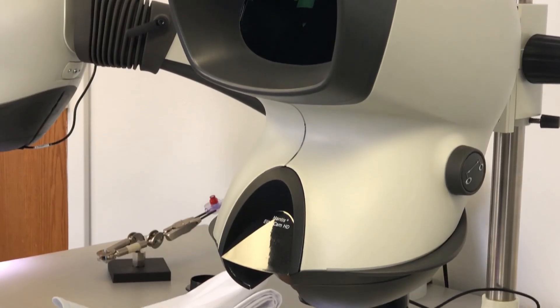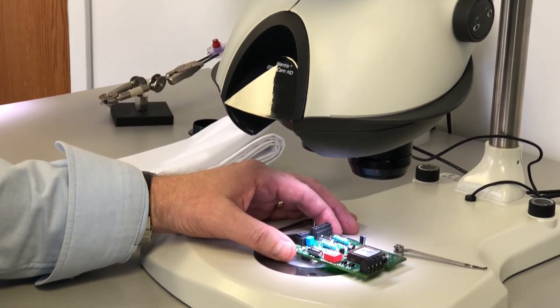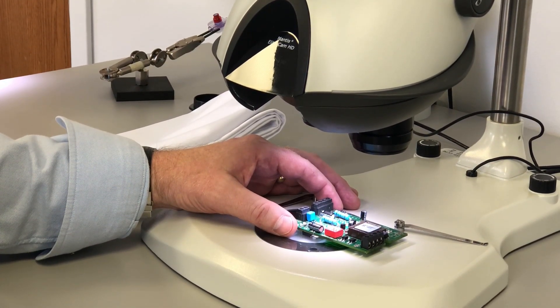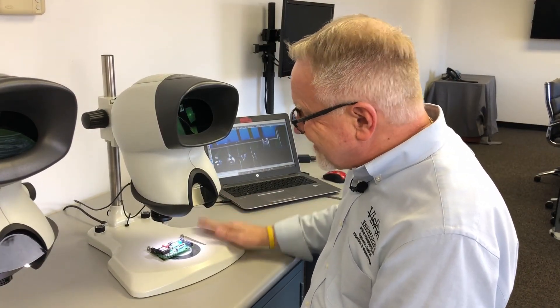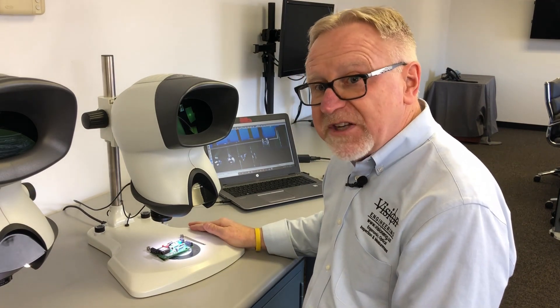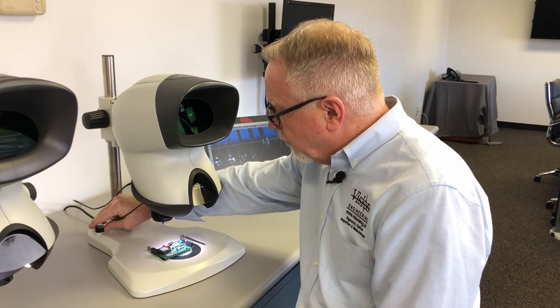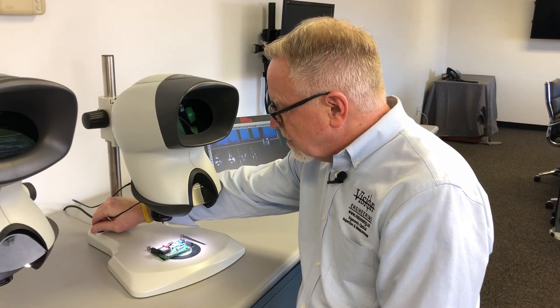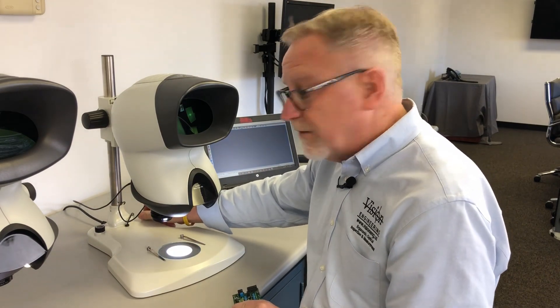Here the Elite is sitting on our bench stand, and it's also available on the same stand that the Mantis Compact was on. On the bench stand as we have it configured now, this stand gives you the ability to have both transmitted and reflected light. I have rheostat control over my surface illumination and a separate control for transmitted light — my substage illumination. This is the only stand we offer that option on for people that need that kind of illumination.